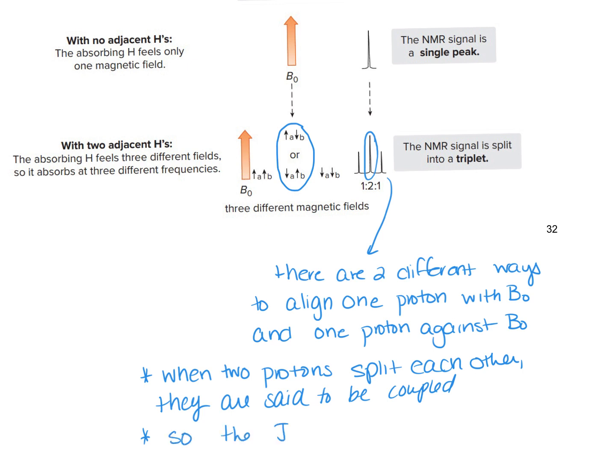So the coupling value is the same. So this means that if you make these measurements in between your peaks and figure out these coupling constants, you can figure out which protons are adjacent to each other, right? And so you can figure out what protons are splitting each other. And that is so helpful with really large, complex molecules.